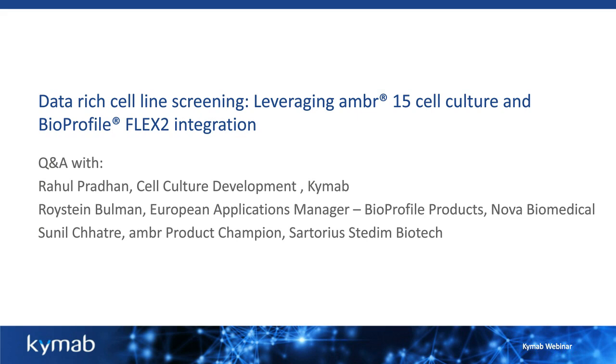When the analyzer is connected to the ambr15, are you able to run any other samples on the system? So yeah, you can actually run samples while the ambr is hooked up to the FLEX2. Obviously, when the ambr is sampling, the FLEX will be busy and you can't run a sample. But in between samples, yes, the FLEX is fully available for any other samples. Okay, thank you very much.